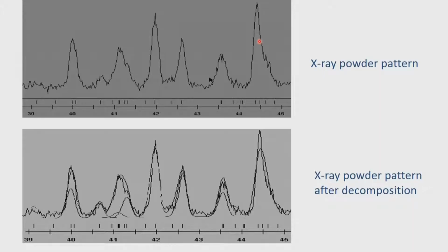Now here is a situation where we jump onto the determination of the structure. See, the number of peaks that are produced in a diffraction experiment, whether it is a powder diffraction experiment or a single crystal experiment, is limited to the number of access points we have on the limiting sphere, the reciprocal lattice information. So that means that all the reflections that we can collect on a single crystal should also be possibly collected in a powder. It depends upon what range of 2 theta we are covering.